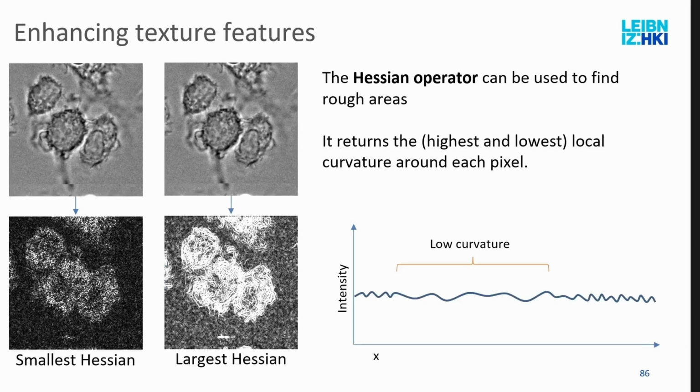And then something that you will encounter with transmitted light images. This is actually a set of filters that was developed by Sultan that he figured out. The problem was we have these transmitted light images and we really need these macrophages. And as you know, you can of course stain them, but in this original data, the staining was not so successful and was really uneven and basically unusable.